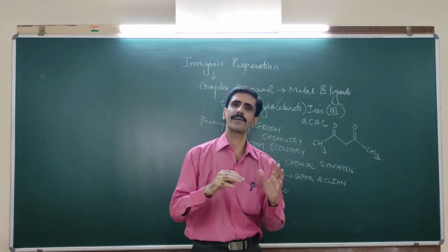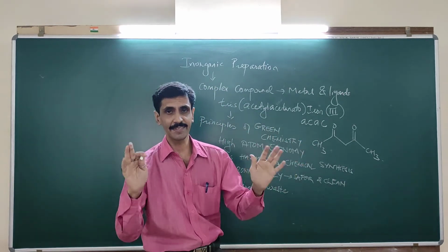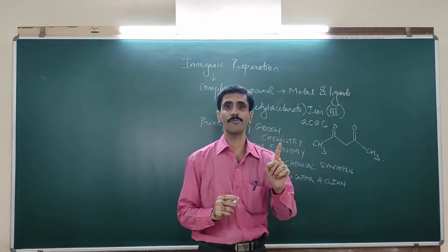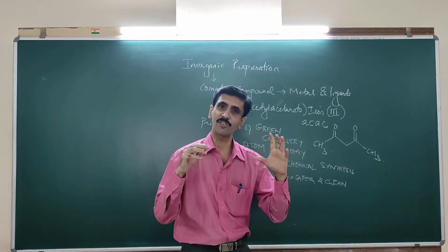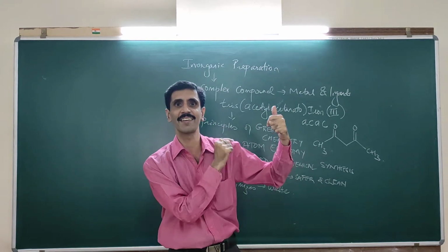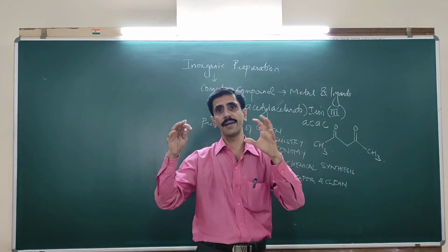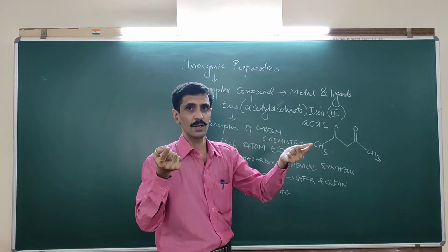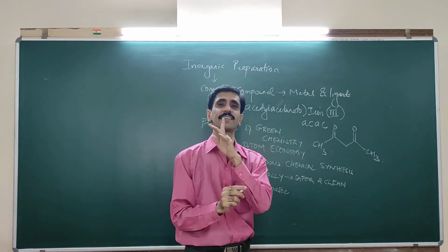Next point, my dear friends. Generally, whenever we talk about chemistry practicals, there are exceptional cases, but generally they are categorized into two parts, qualitative as well as quantitative. Whether a particular experiment is qualitative or quantitative depends upon the end result. Here, in this experiment, the end result is to find out the percentage yield. Okay, determination of what? Percentage yield.